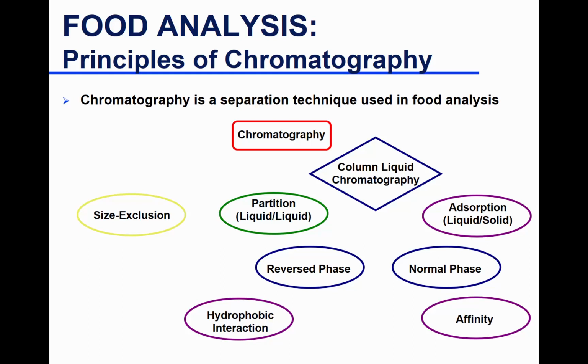So this is a very specific interaction, and we'll talk about it more. And the ion exchange chromatography is based on ionic interactions, where charge is involved. So all of these, 1, 2, 3, 4, 5, are under adsorption chromatography.